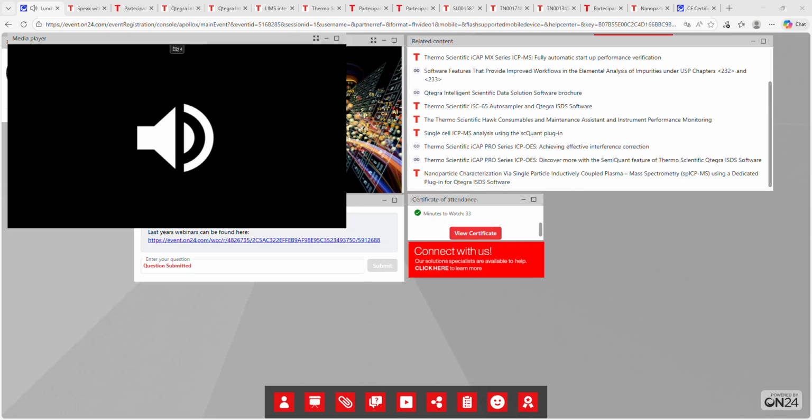What would be an optimal exposure time for a measurement that is measuring 30 elements at a time? We have up to 600 samples a day, so it would be very nice to go from 3 minutes down to 2 or even 1 minute of measuring time for each sample.